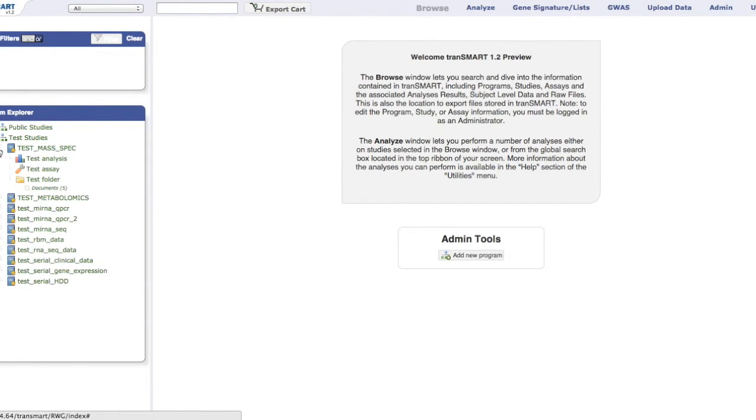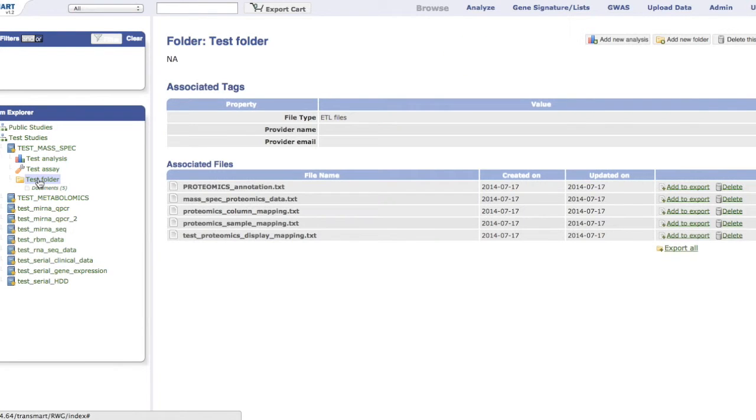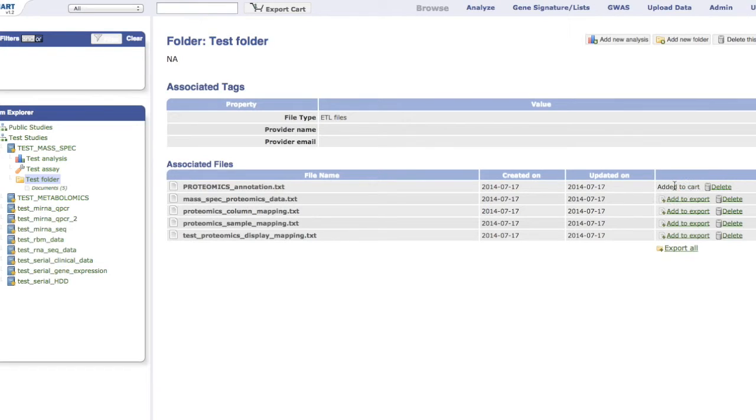Click the Add to Export link to the right of the file, or the Export All link on the bottom for all the files in a folder. Click on the Export Cart on the menu bar and click Export Selected Files to download to your computer.